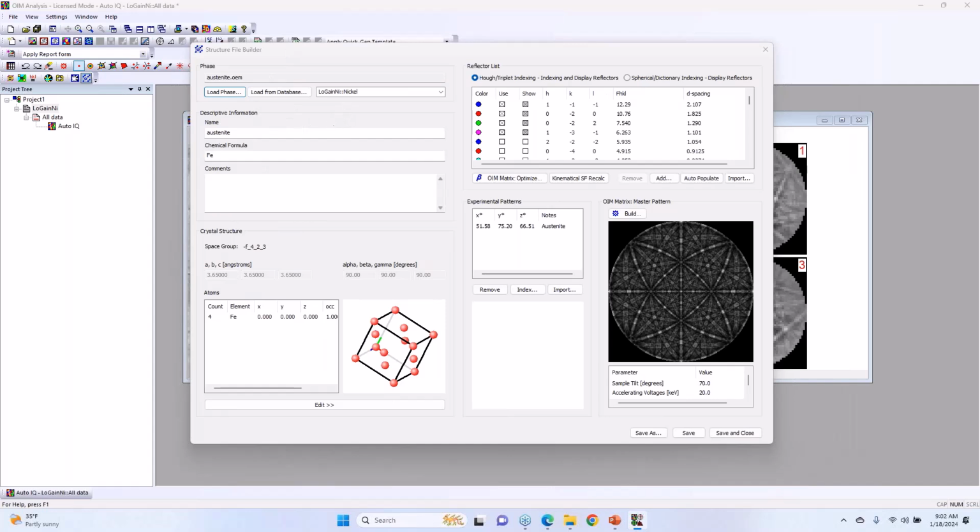I mentioned during the talk, we need to know what the crystal structure information, the group information, is. So this is the space group here. These are the lattice parameters. These are where the elements are in this unit cell. Up here we see the planes that we expect to diffract when we're doing Hough indexing. So there are these first 4 plane families. For our software, it's important to know we deal with plane families. So we talk about a 111 type, but we label it here as a 1 bar 1 bar 1. The system figures out all the crystallography.